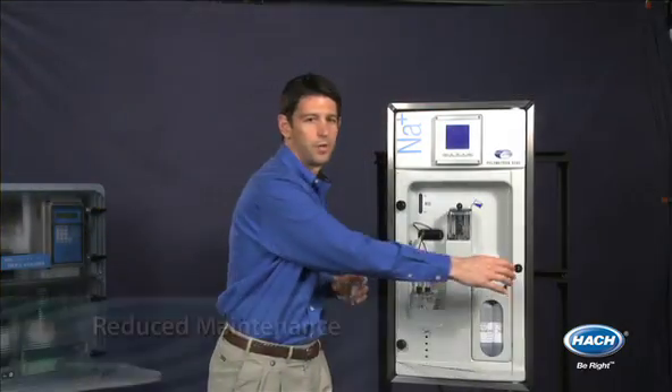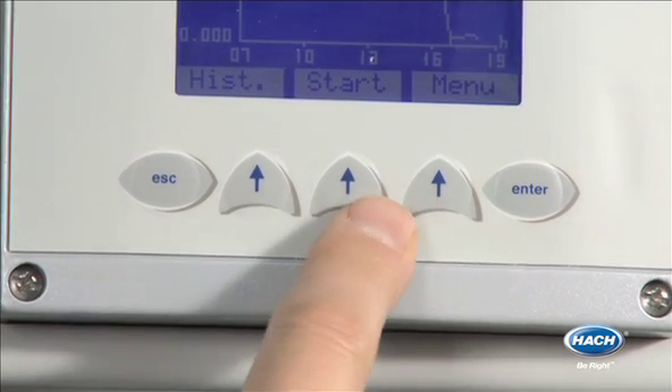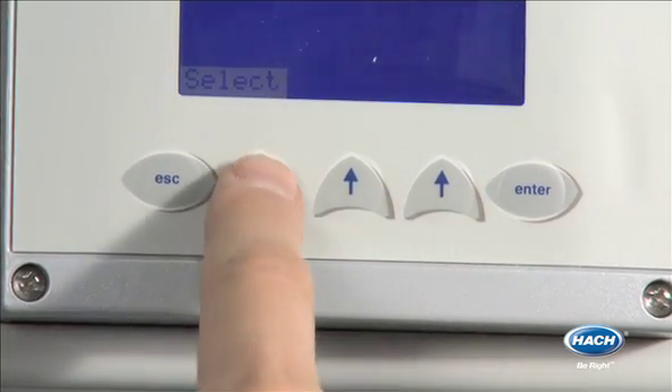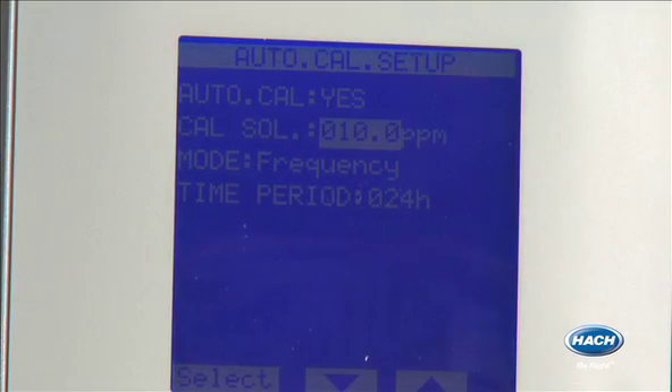The 9240 is virtually maintenance-free thanks to its auto calibration feature. With auto calibration, you save time and ensure instrument accuracy simply by setting the frequency or a fixed date for the instrument to execute calibration. That's all there is to it.